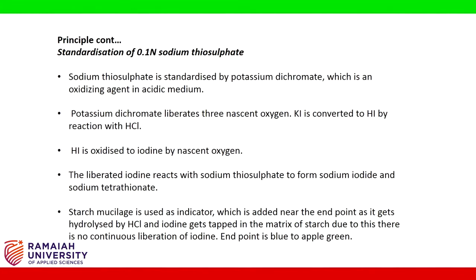Starch mucilage is used as indicator, which is added near the end point as it gets hydrolyzed by hydrochloric acid and iodine gets trapped in the matrix of starch. Due to this, there is no continuous liberation of iodine. Endpoint is blue to apple green.